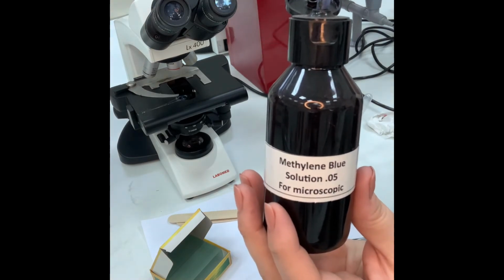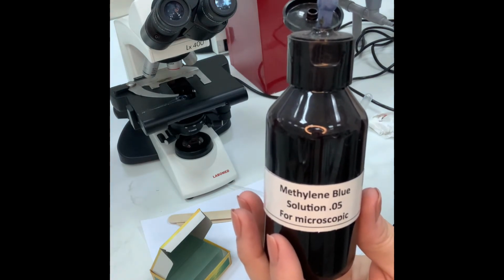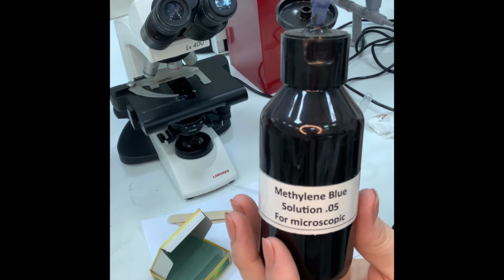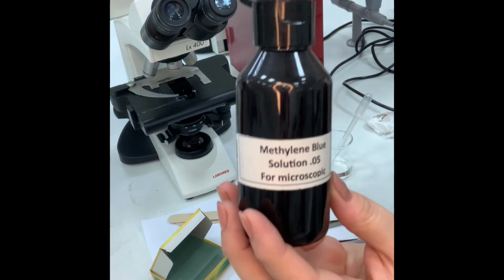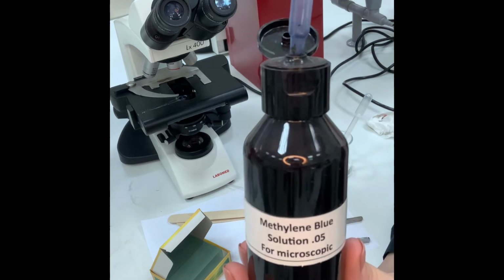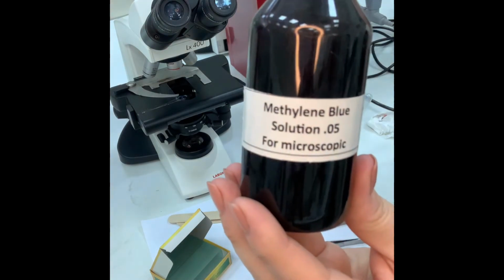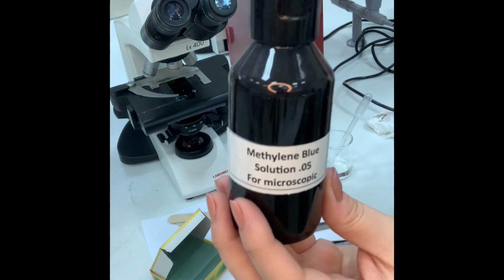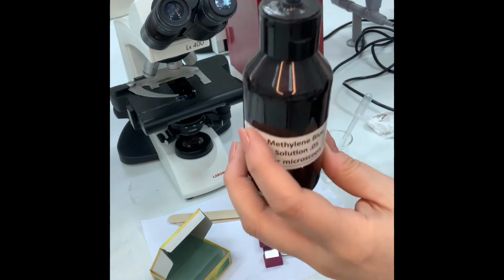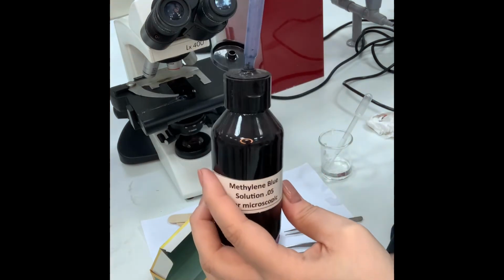It only dyes the cells without affecting the cell. It reacts with the nucleus and it makes the image clearer. So in order to define the stain, it is a dye, it reacts with the nucleus, it makes the image clear. That's it. Okay? So in my case, I'm using methylene blue, not iodine, not methylene red. I love blue color. This is the reason.